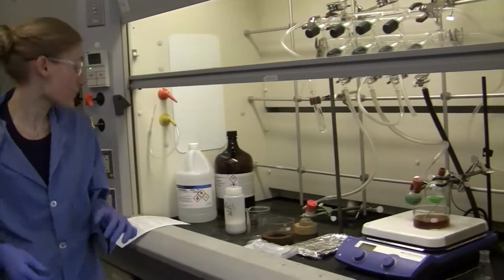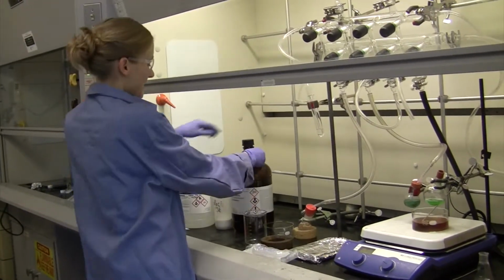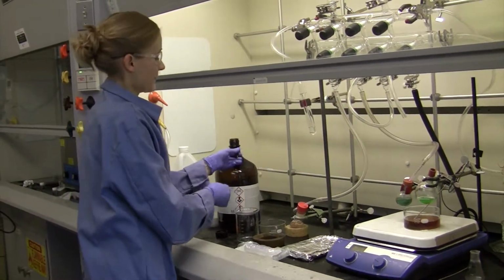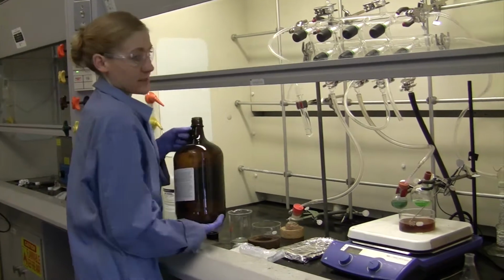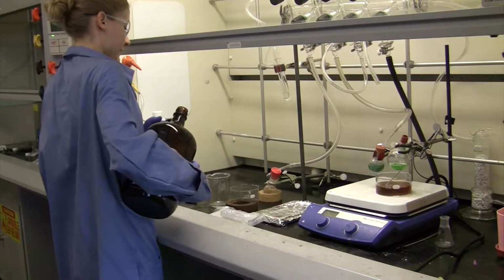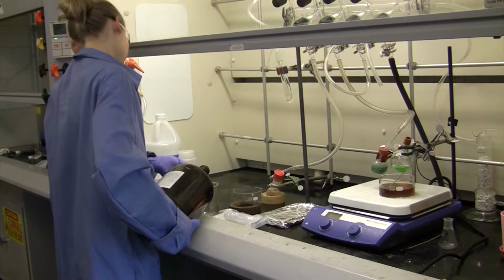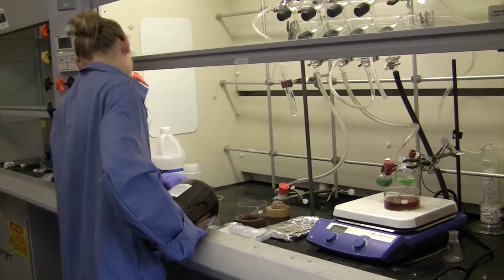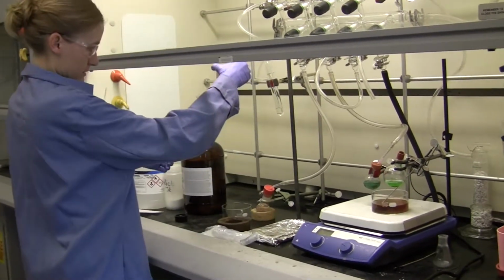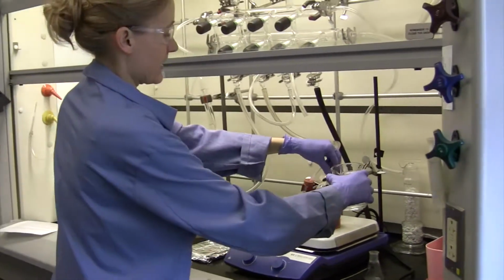About 30 milliliters of chloroform. So the addition of the chloroform, you can basically eyeball the amount. It doesn't need to be precise. So we aren't going to use a syringe. I'm just going to pour a little bit, because this is pretty heavy, into another glass. Alright. I'm just going to add this here.